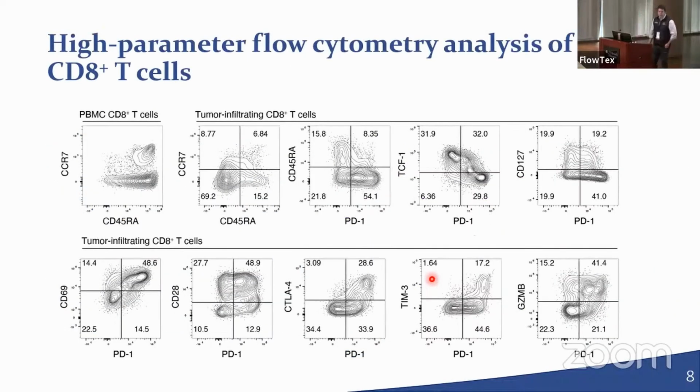So I'm going to show you some of the plots. I'm going to get into dimensionality reduction and things like that, but I really like to go through and look at the individual marker expressions, because when you know about the biology of the T cell or the cell that you're focused on, you know which cell should stain for what, and it gives you an idea not only of the biology, but how well your panel is working.